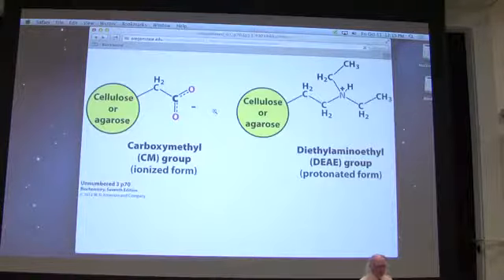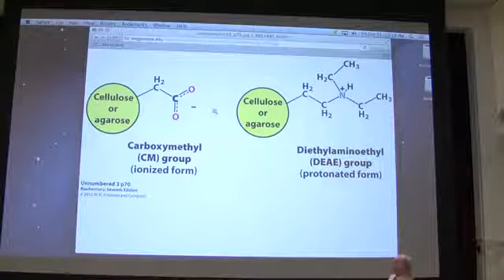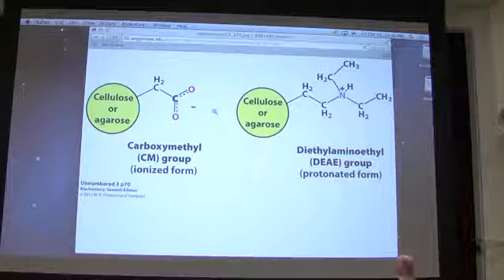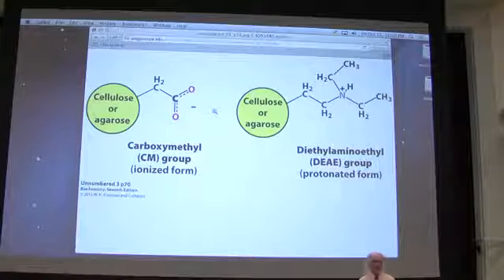Okay, this just shows you the chemical structures of some of these things. You don't need to know them. I'm just showing them for your own information. There's the structure of a resin that would be used for cation chromatography. This would be used for anion chromatography. Remember, it's named for the counter ion. So the counter ion is positively charged. The counter ion here is negatively charged.